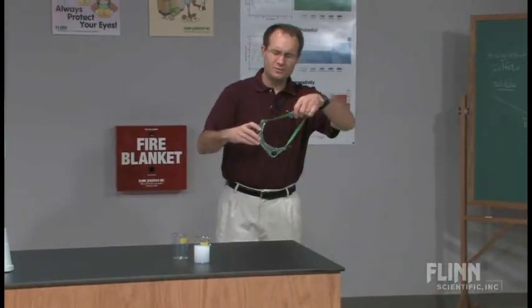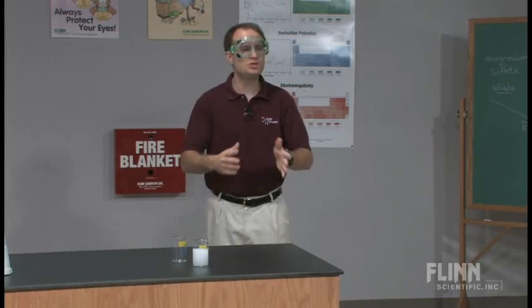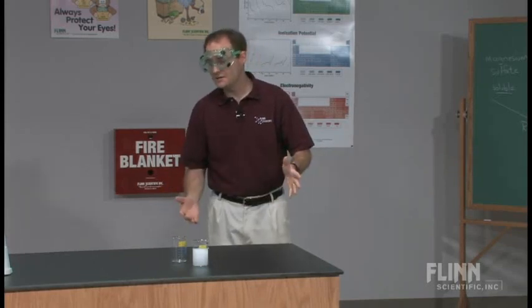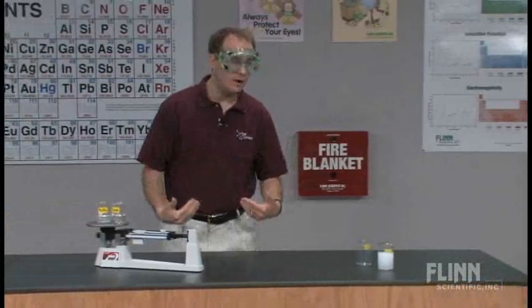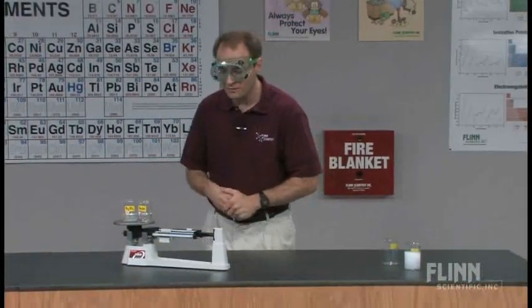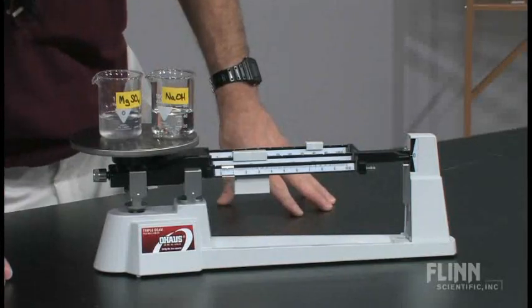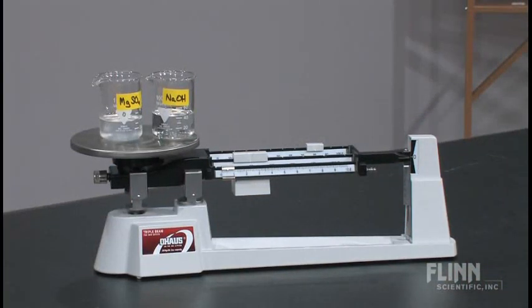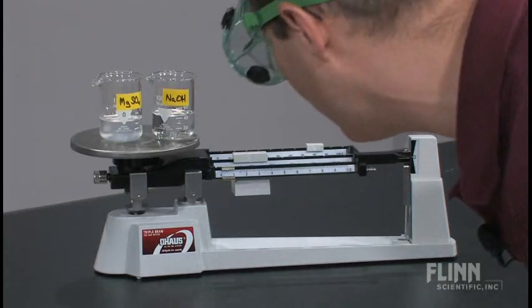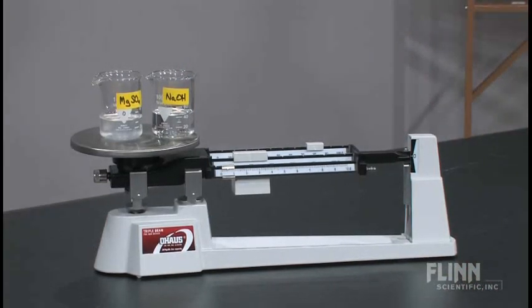Many times we teach definitions first, but in this case, what I want to do is show them something first, ask them to make some predictions, and then share the definition of a concept with them. I know where I'm taking them, but I don't want them to know. They're along for the ride. What I have here would be the same solutions, okay? The same solutions in the beakers. And I've already, to save some time, measured the total mass of the system. It is balanced. I'm reading 180.50.